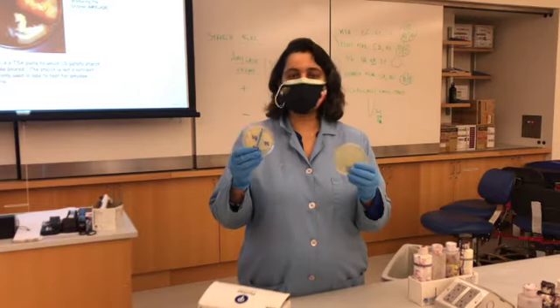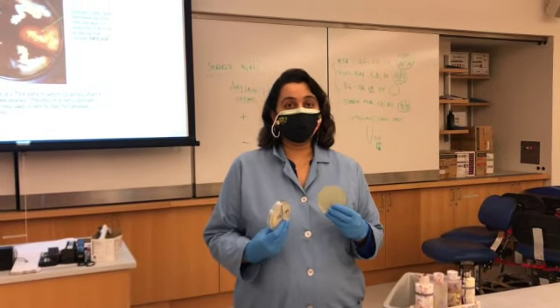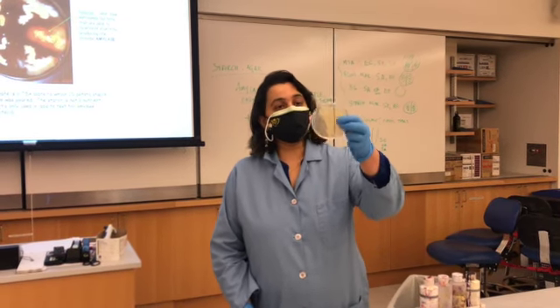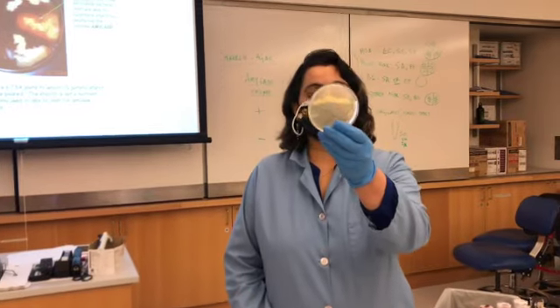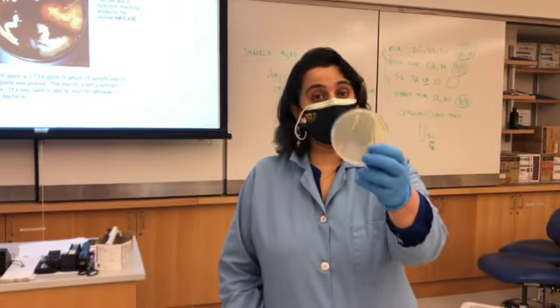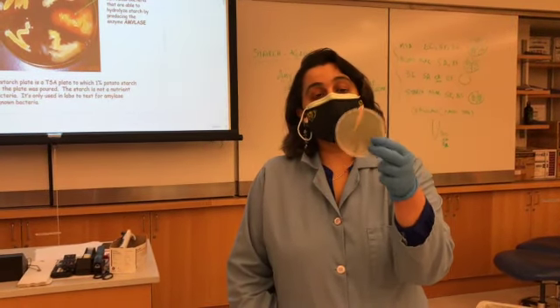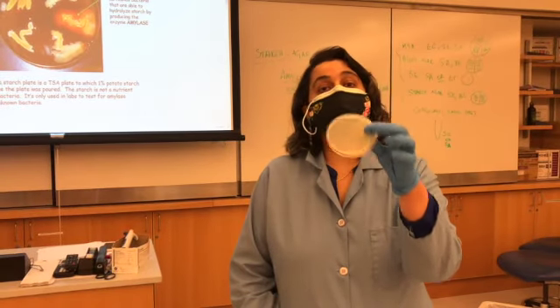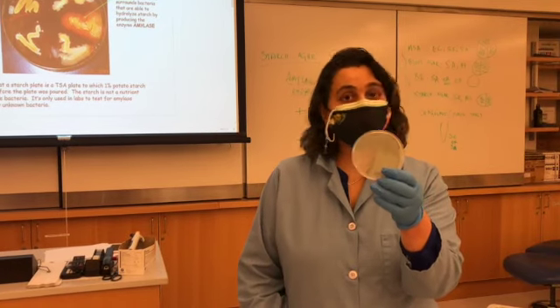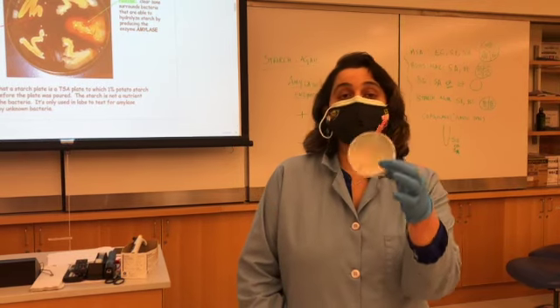Okay? Another gram-positive diagnostic test that is commonly done in microbiology labs is the starch hydrolysis test. So, you're seeing the starch hydrolysis agar plate. It's very similar to your TSA plate. It's actually nothing but your TSA plate, but we add starch in it. And this makes it a differential only plate. So this is not a selective plate. Any bacteria can grow in it because it's nothing but your TSA plate. Because it has starch, it becomes a differential plate.